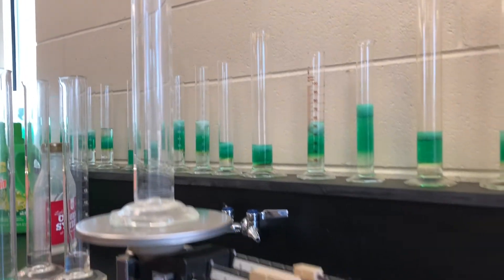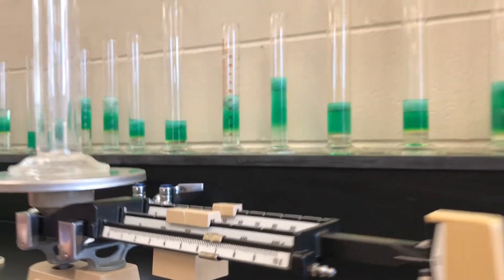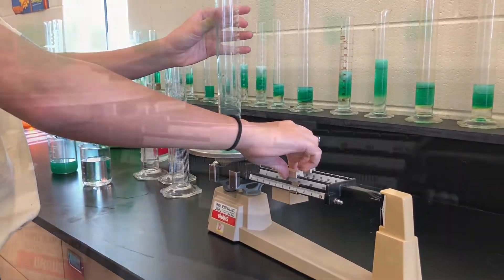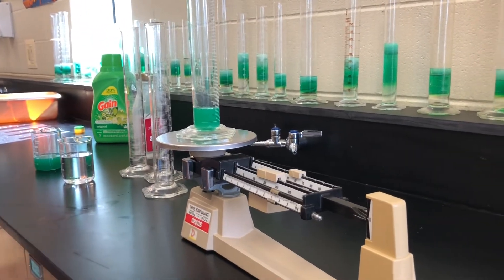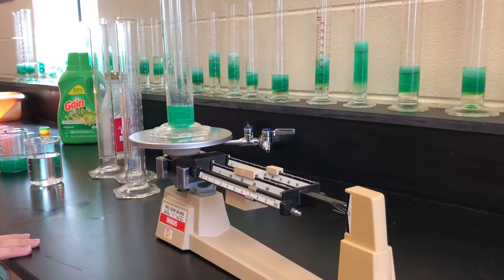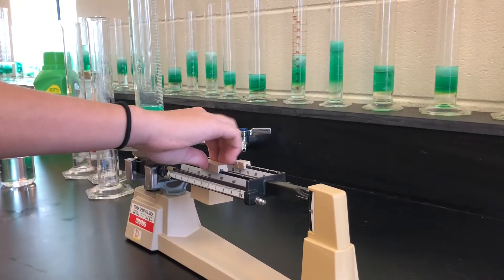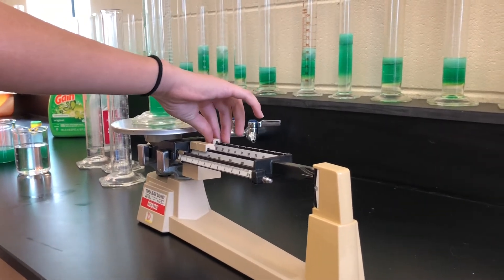Measure the mass of the graduated cylinder and record this in the first column of your table. Measure 25 milliliters of laundry soap and record this in the volume column of your table. Measure the mass of the graduated cylinder with the laundry soap included and record this measurement in your table. Calculate the mass of the liquid by subtracting the mass of the graduated cylinder from the mass of the graduated cylinder with liquid using the formula below.